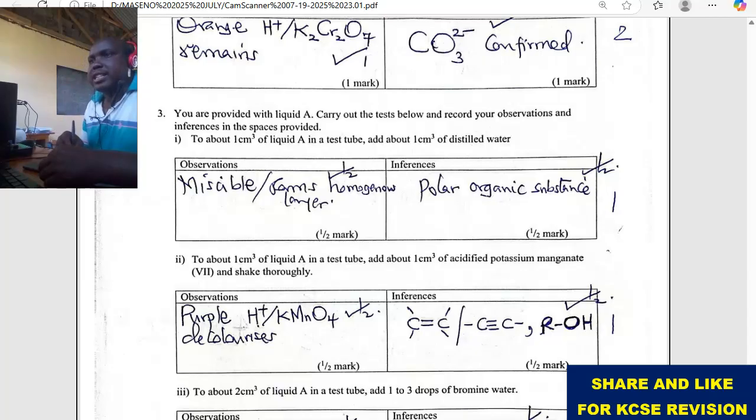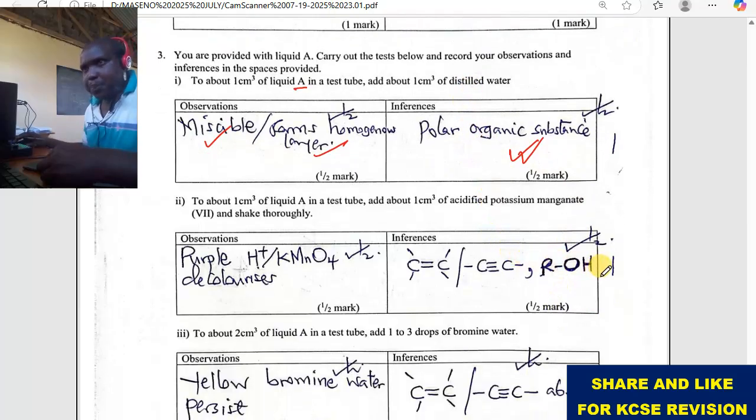Did the distilled water mix with liquid A to form a miscible liquid? Yes. It forms a homogeneous layer, or it is miscible. That means the compound is polar. The key word is polar, because anything that dissolves in water must be polar for sure.